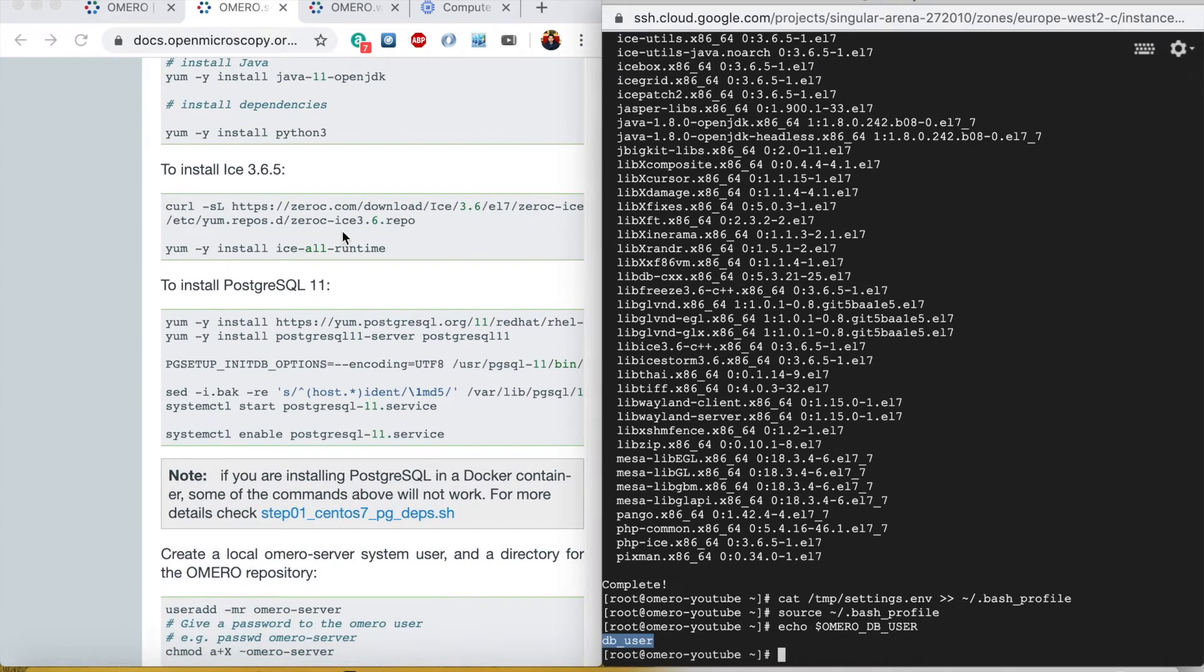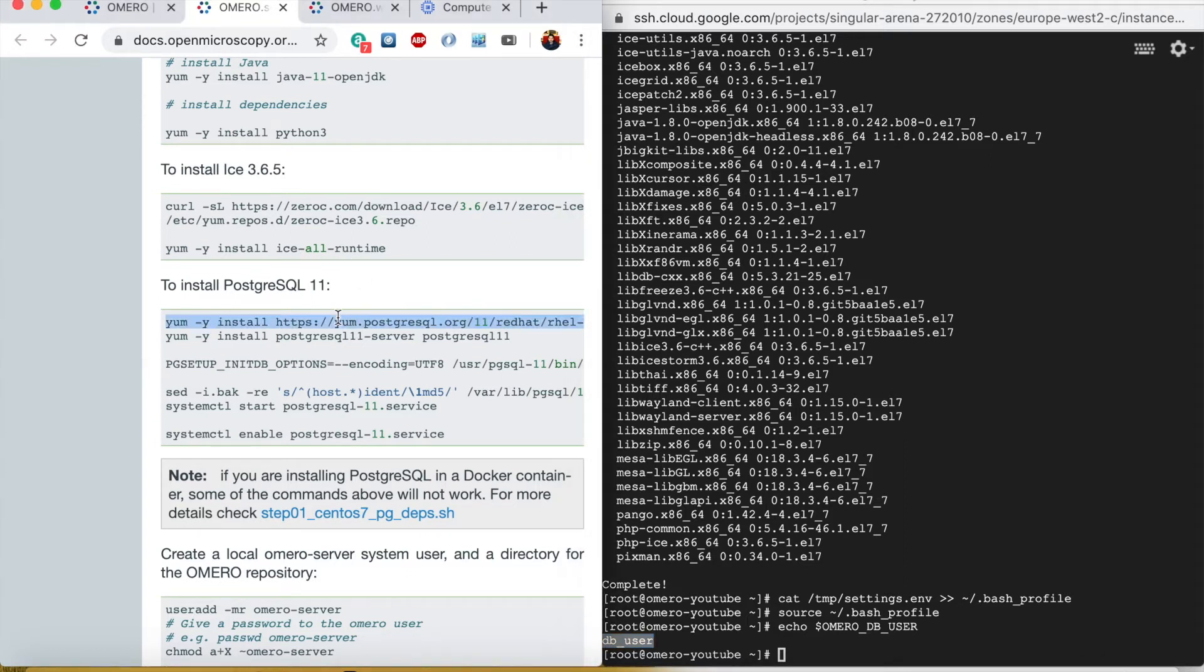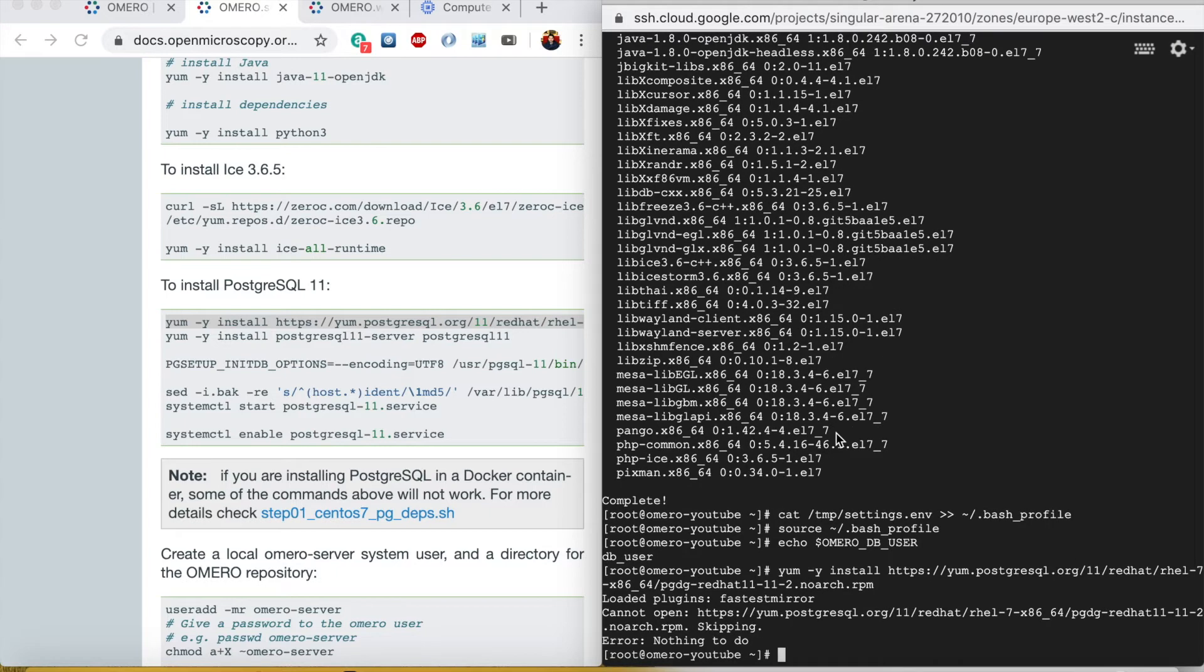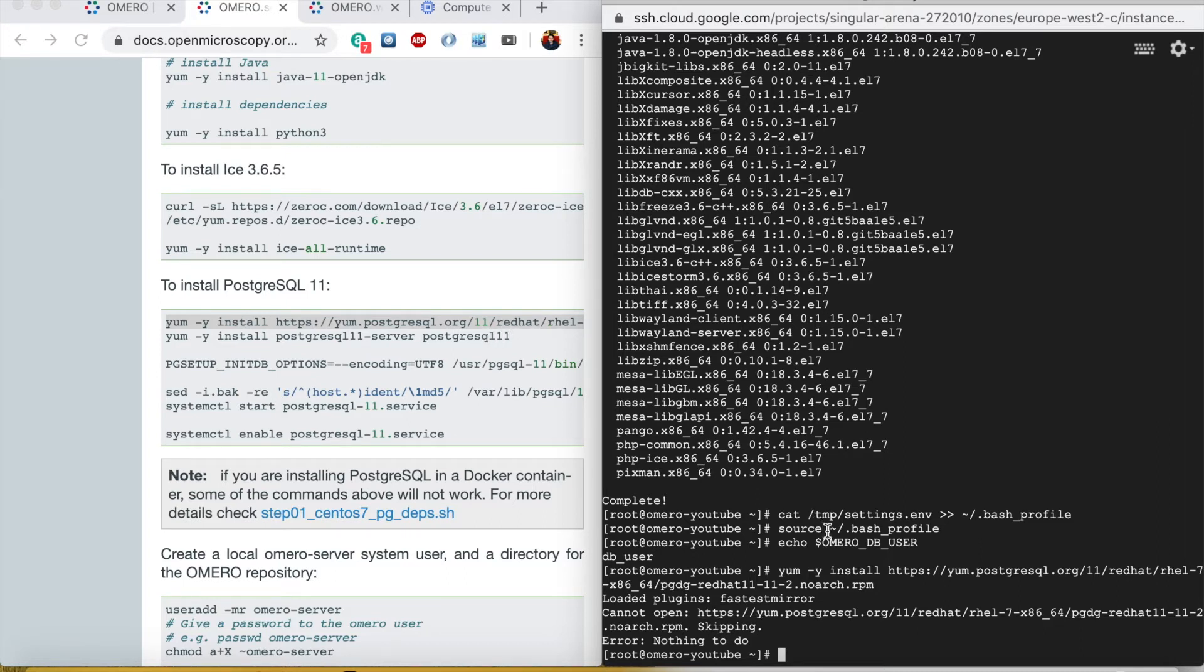We installed Ice, so now to install the PostgreSQL server we will install this tool. Now I noticed that this RPM is not working, its address is changed, so I found another link which is working so I will install the other one instead of this one.